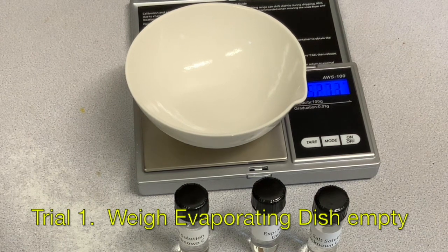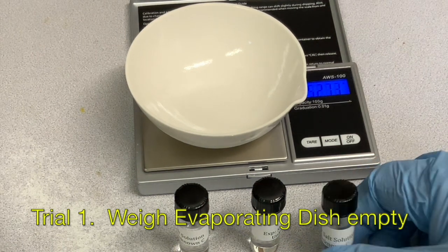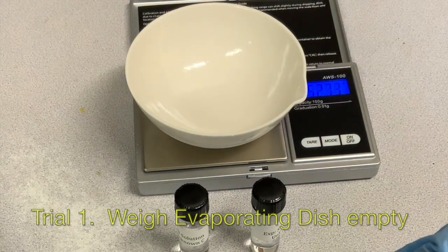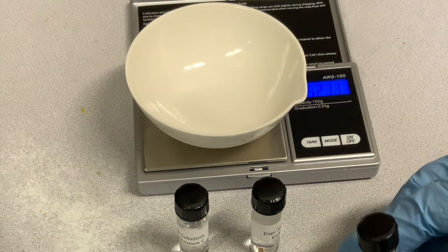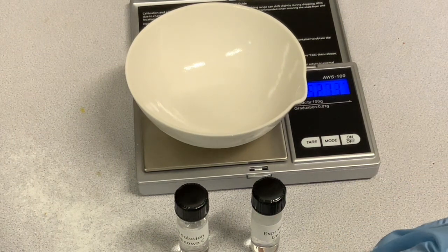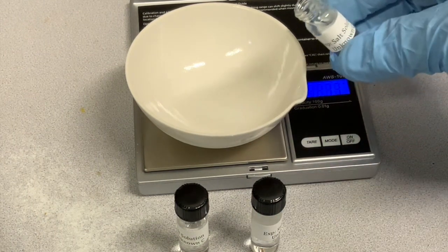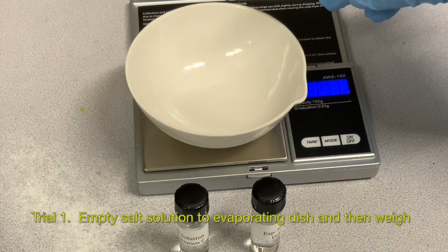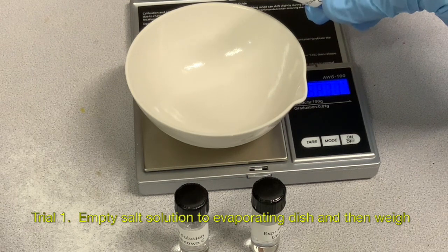So I'm going to record that, and then I'm going to take one of my solutions. This will be number 1, and then I'm just going to add this to my evaporating dish. So my initial mass is 52.71.